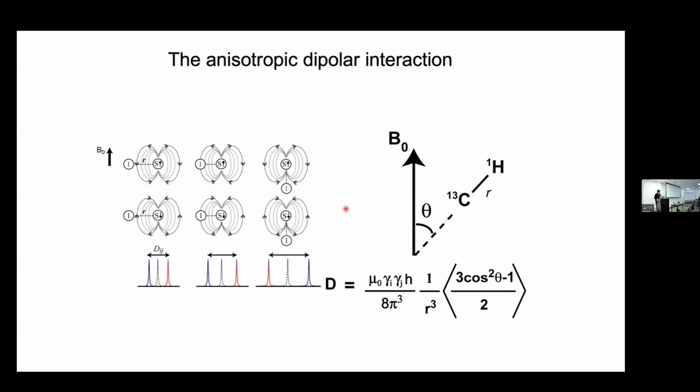And solid state NMR folks spend a ton of time trying to get rid of dipole couplings by spinning at magic angle at faster and faster speeds, just to look like solution NMR. And so you could ask the question, why don't you take solution NMR and make it a little bit more solid? For once, let's go the other way. Let's go from solution to solid, but maintain the resolution of solution NMR.